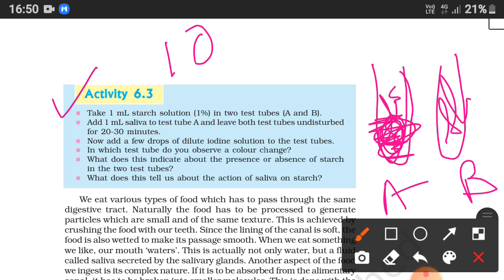Leave both test tubes undisturbed for 20 to 30 minutes and observe what happens. As I have already told you, saliva contains the enzyme salivary amylase, which converts complex starch into simple sugar.